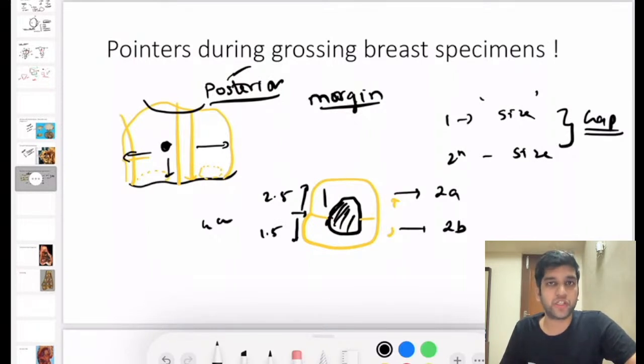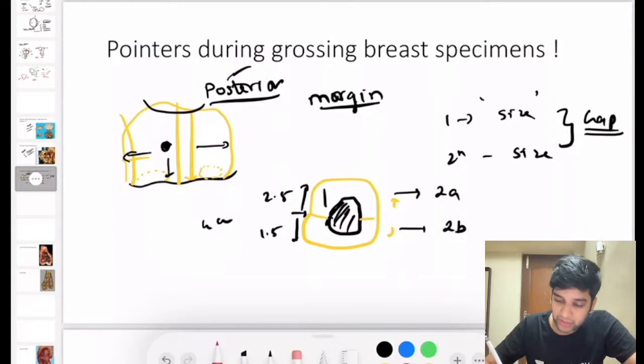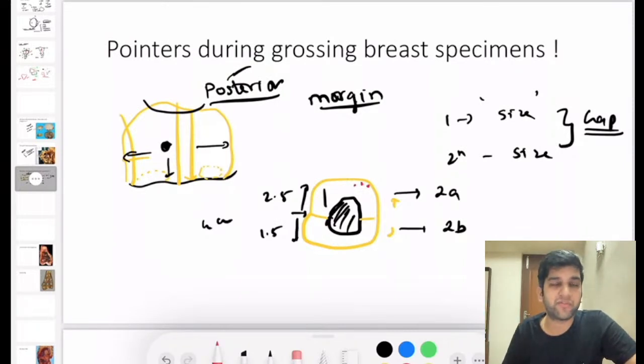If it is more than 2 centimeter, don't put it in a slide, sequentially gross it and measure the centimeter microscopically, because who knows, there might have been a few cancer cells here that will make it more than 5 centimeter. That will make it T3, T4, right? So that's very, very important to measure it sequentially on a microscopy and then give the TNM staging, fine.